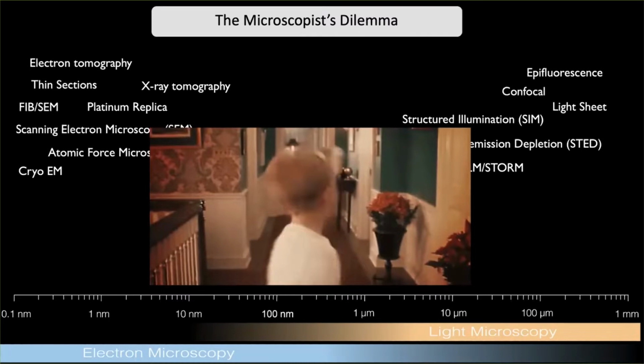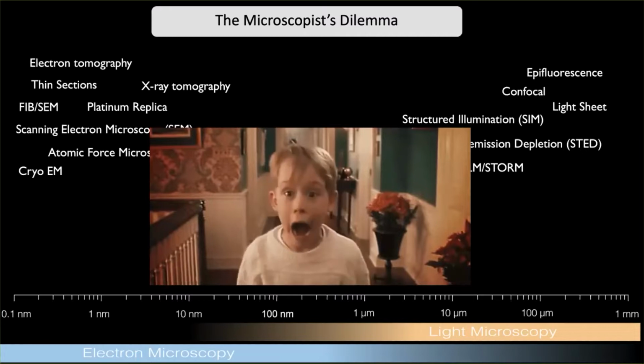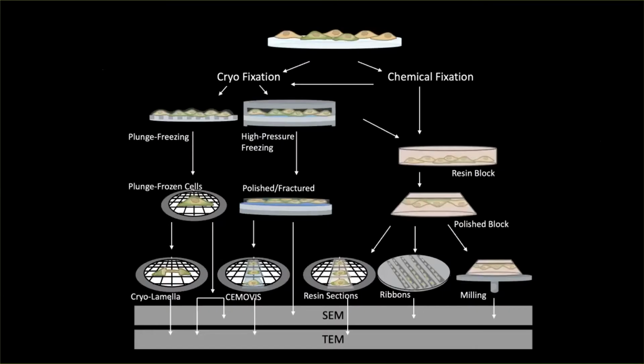And as a community, and I haven't said it in the beginning, but as a member of COMULIS, I really benefited a lot in refining my thinking about CLEM, because as a community, until now, we have created a lot of such diagrams. So we can really detail all of these different workflows as flowcharts, starting from fixation, etc., going down different avenues.